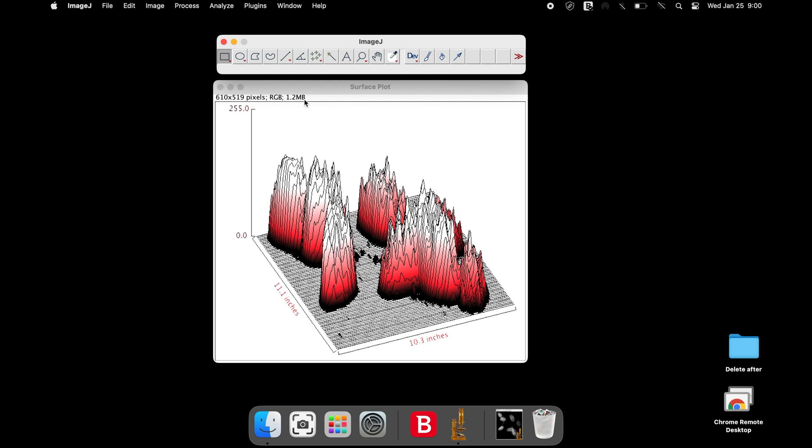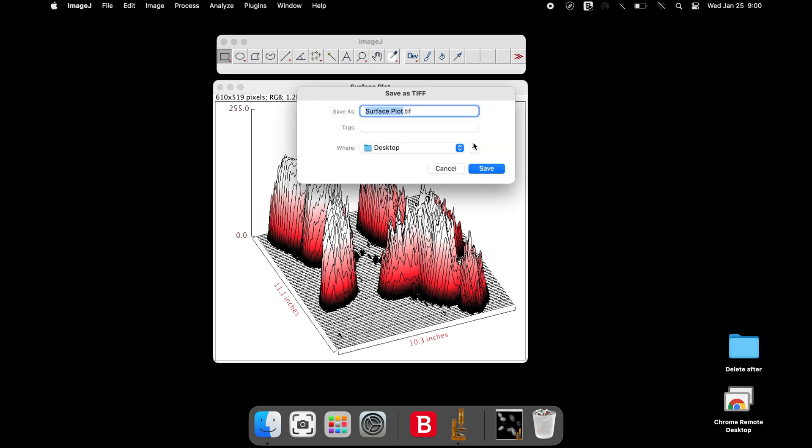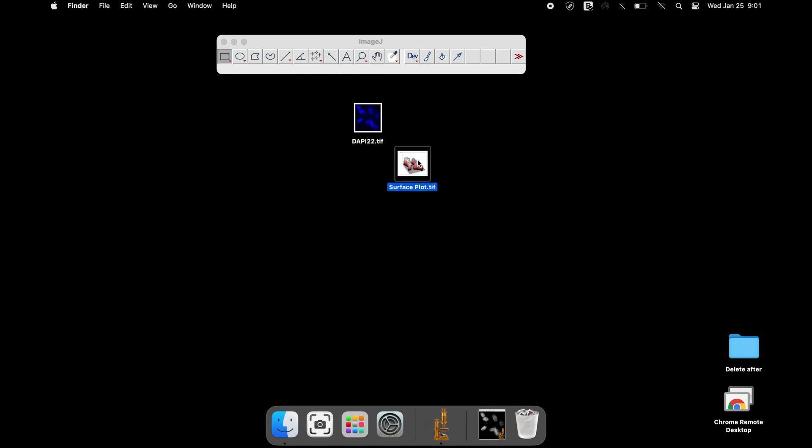To save a copy of the surface plot image, simply attempt to close the image and there will be an option to save the image.